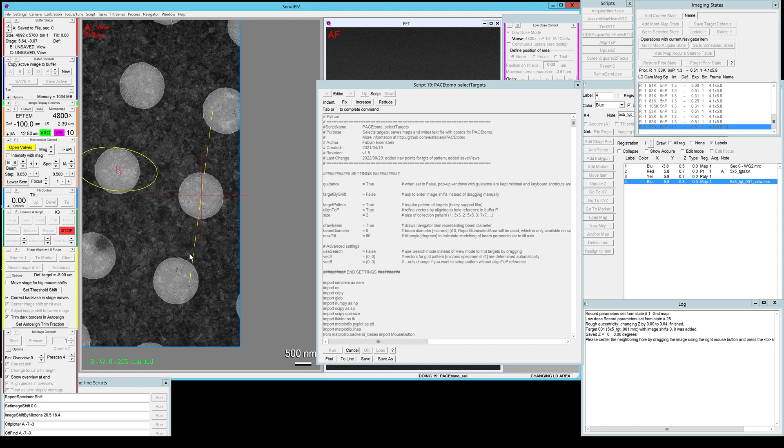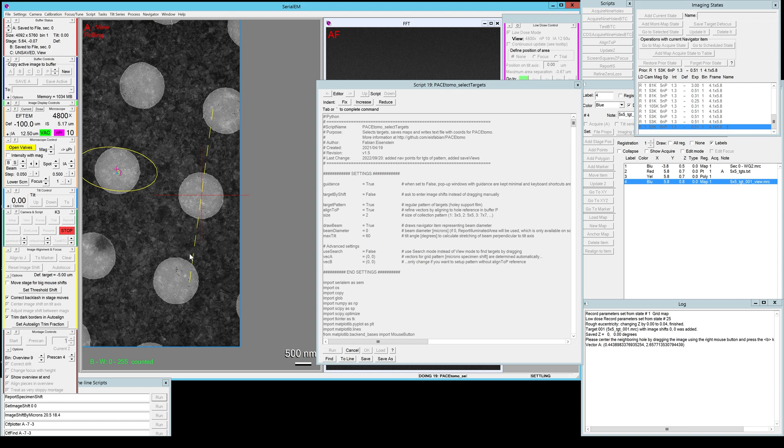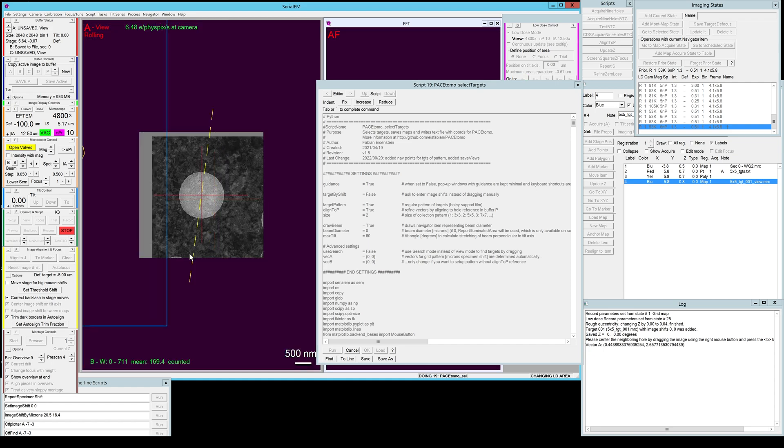From this it determined the vector A and it will assume that the vector B of the grid is perpendicular to that vector.